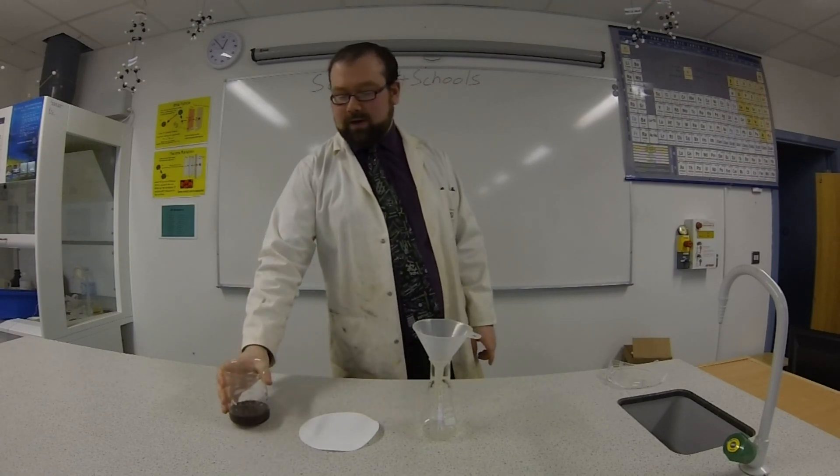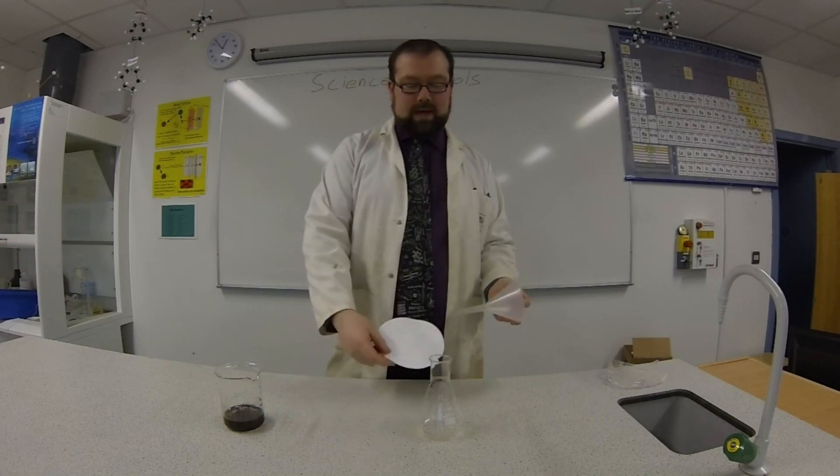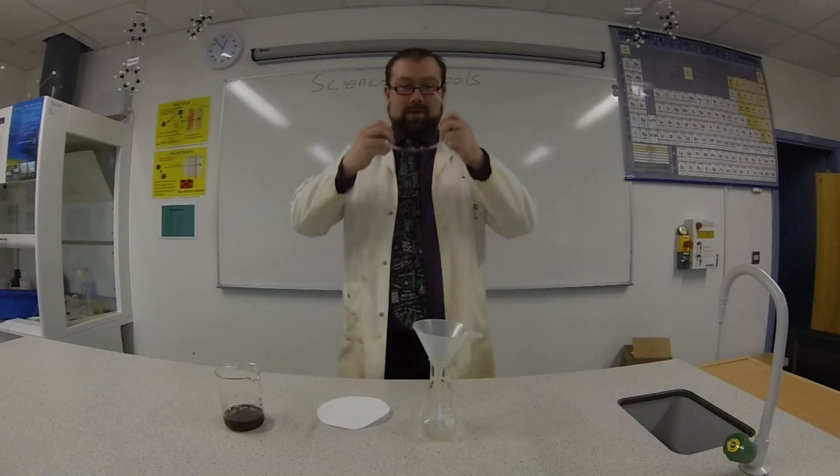We have this beaker with our mixture, we have this filter paper, we've got a funnel, and we've got something to put the clear water in. Most importantly, we have our goggles on — make sure we can see the results.